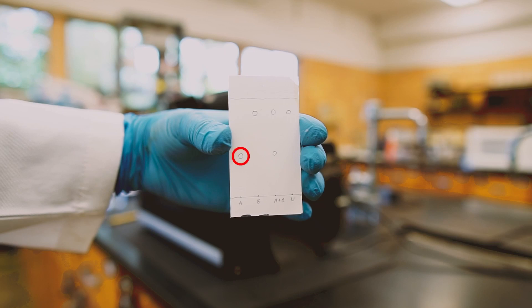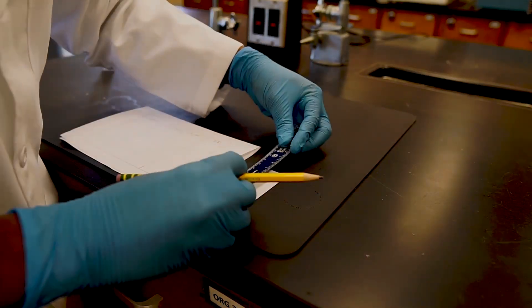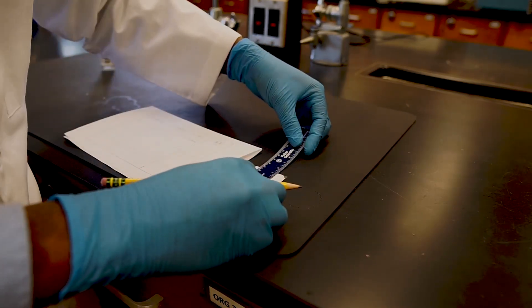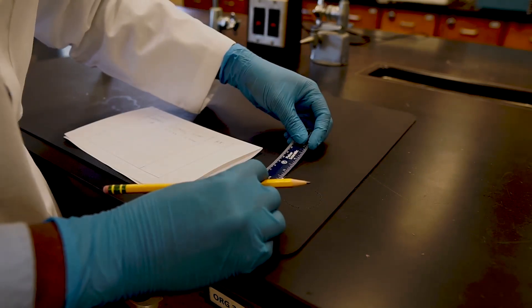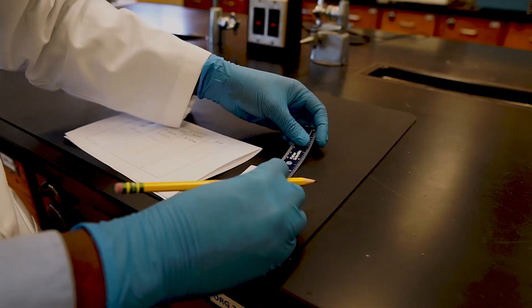As you can see, B traveled farther than A. The spot representing A plus B does indeed show data from both isolated samples. And it would appear that our unknown was B, aspirin. From these results, we can also verify that A is more polar than B, which is why it didn't travel as far up the plate. We can even go further with our analysis by quantifying our results. This is done by measuring the retention fraction, or RF value, for each sample. This is calculated by taking the distance traveled by the sample and dividing that by the distance traveled by the solvent, so any RF value will be some fraction of one. We can do this by measuring the distance from the line at the bottom to the middle of the spot using a ruler, then measuring the distance from the bottom line to the solvent line, and dividing the first by the second on a calculator. RF values can then be compared to tabulated data in order to confirm their identities.